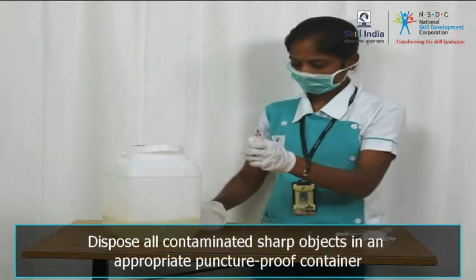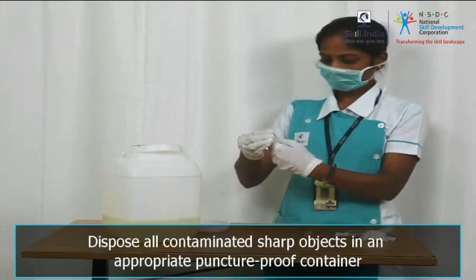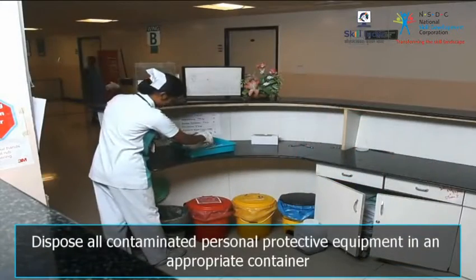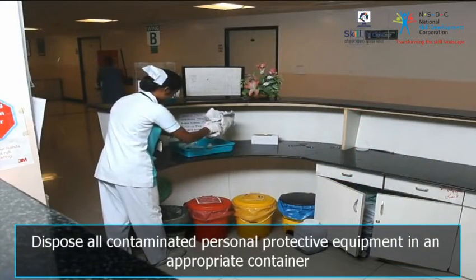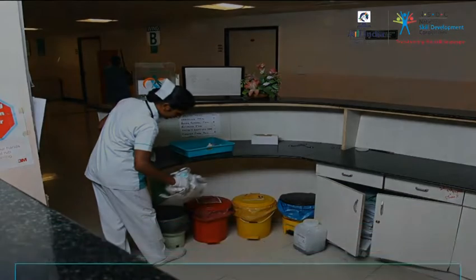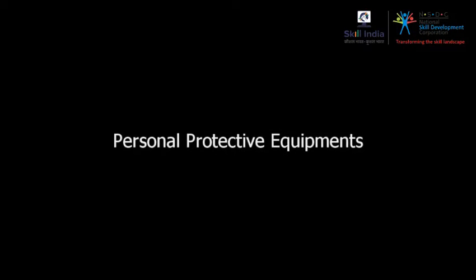Dispose all contaminated sharp objects in an appropriate puncture-proof container. Dispose all contaminated personal protective equipment in an appropriate container. Personal protective equipment.